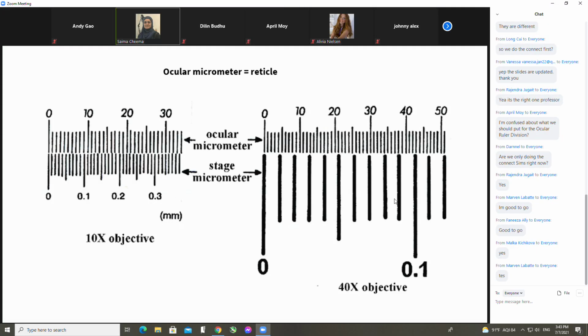Every standard laboratory microscope generally has one eyepiece within which you can find a ruler, and you can use it to measure how large something is, but you can't give it any standard units because it doesn't contain any units until you calibrate it, so that you know the distance in standard units between these two adjacent lines. So that's what we're going to do. We're going to use a stage micrometer, which actually has standard units, okay?